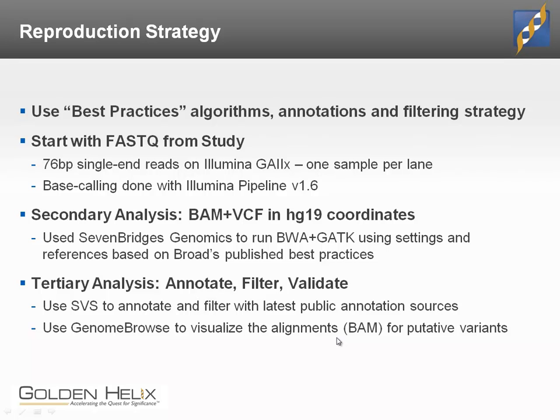But when we're talking about an Illumina machine, we have 76 base pair reads. There are regions of the genome where that simply is not enough to uniquely align that read. And so there are going to be places where pseudogenes exist, or other types of common duplications and trinucleotide repeats, etc., that are going to be problematic from a variant calling perspective.